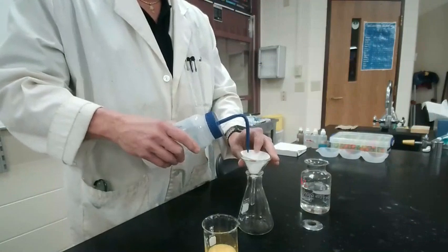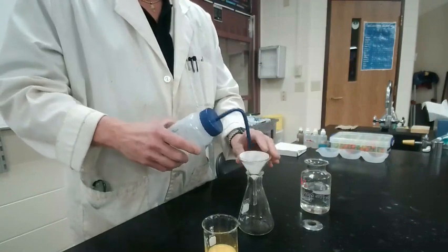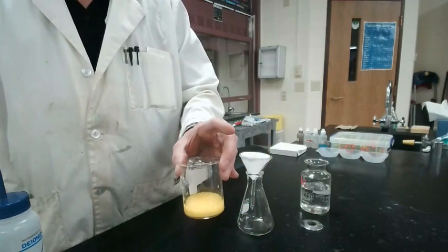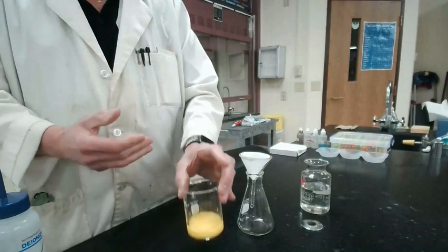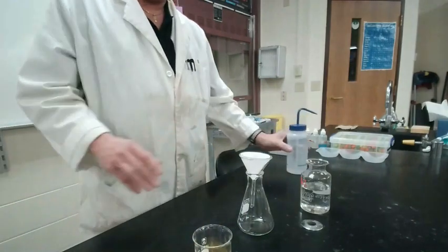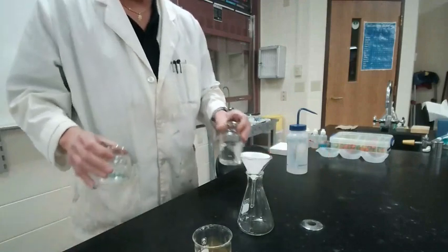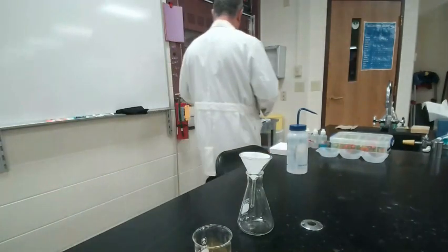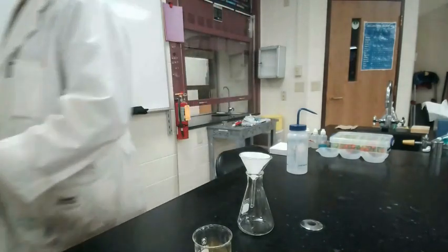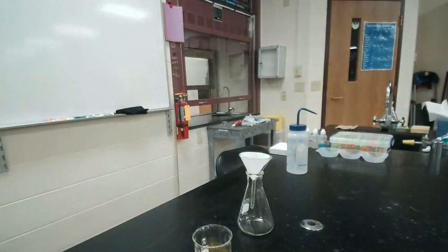And I'm going to wet it down. This is what I'm going to filter this substance through so that I can separate the precipitate from the liquid that is in there. So now I need to give this a few minutes, ladies and gentlemen. We're going to let it sit for a few minutes, and then we will show you what to do next. So coming back in a second.